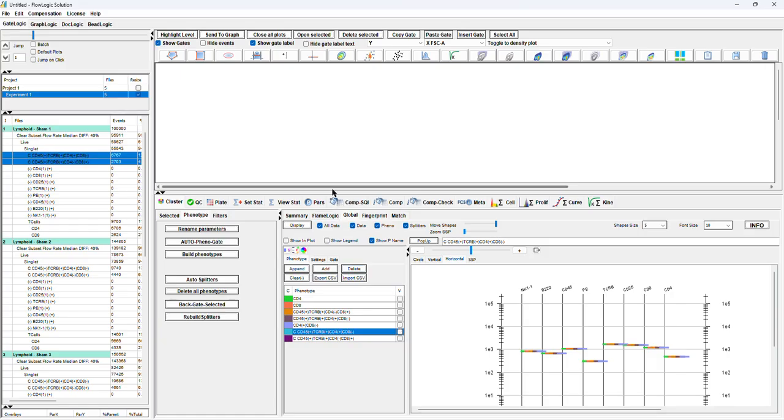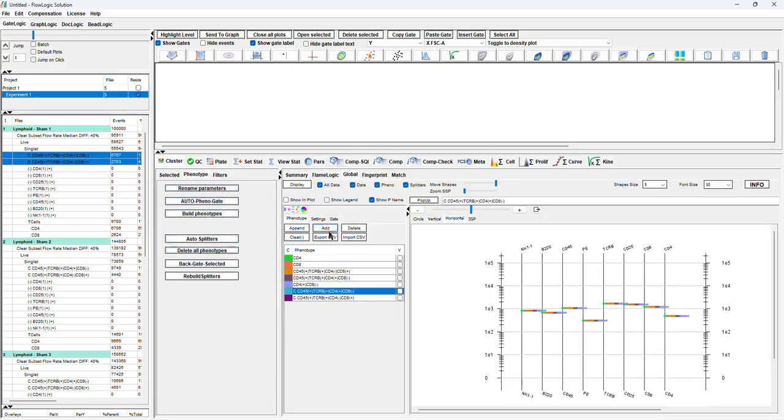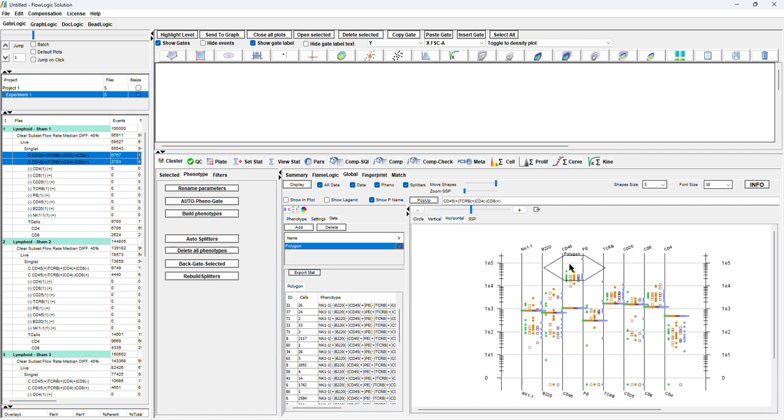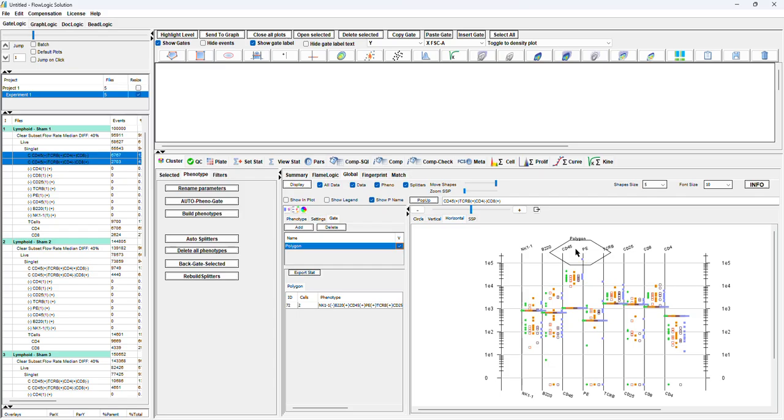Okay, after we did this, we can do even an extraction from here. If you want to explore your data and say, okay, my CD8, I can see for my CD45 I have something very high. So we go to the gate, we add the gate, make the polygon visible, and as soon as we display, you can see, oh, okay, this is just 2 events. This is 3 events. This is, and so on and so forth.